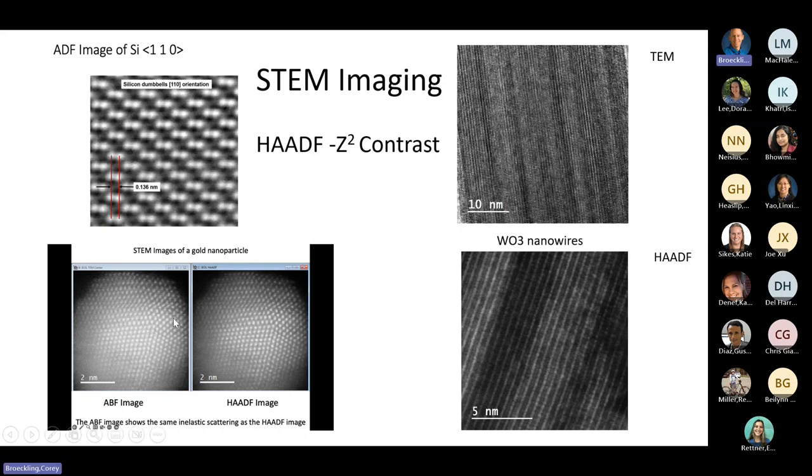Here's STEM bright field image and high angle angular dark field image of gold nanoparticle showing the individual columns of gold. You're not seeing individual atoms, but you're seeing columns. The scattering, the stronger the scattering, the deeper or the longer the column. STEM imaging is Z squared, atomic number squared, approximately. So as you increase Z, you really do get difference in scattering.